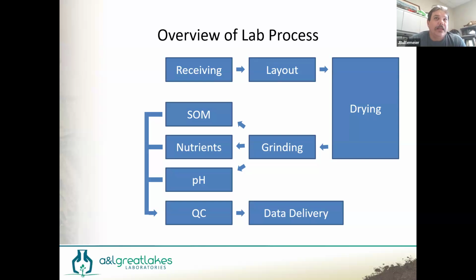We actually hold all that data till the following day, so 2 days after the sample arrived, because we want to look at the data all day long. We've got some known samples in there. We've got checks we want to look at. Did something bias a little higher in the morning than the afternoon? Is there something different about it during the day?